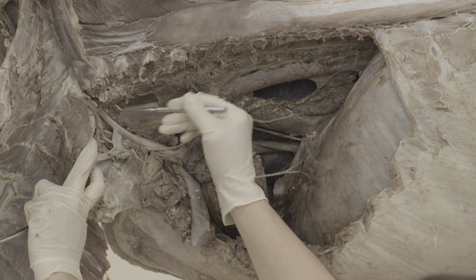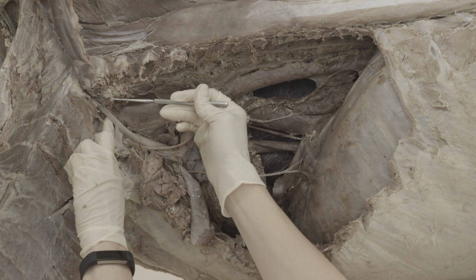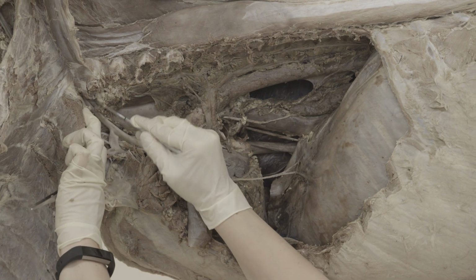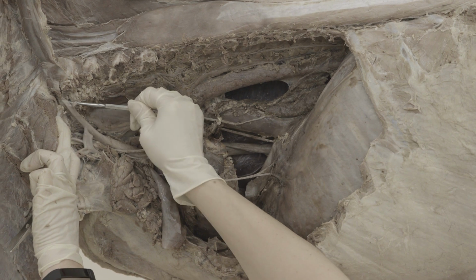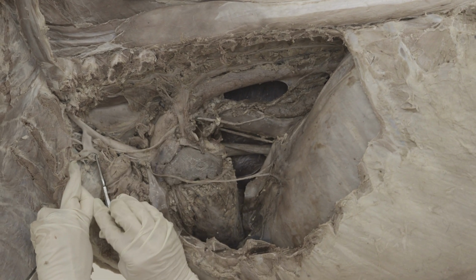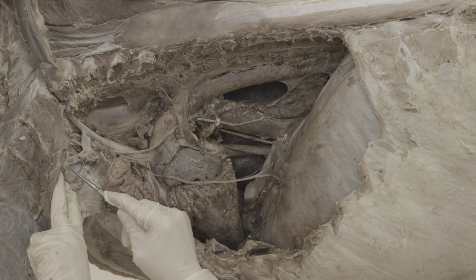And on your vertebral, it actually looks like we have our costocervical possibly coming off there rather than as a separate branch. So vertebral, but you have this common trunk. So common trunk, and then you have a costocervical artery that would go here and would have gone to the ribs. And then we have the vertebral, which I'll try and kind of pull out here. So vertebral is going deeper up towards the back there. So vertebral, costocervical, internal thoracic, the one going down inside the chest, and then the continuation here is axillary. So that's what's going out into the forelimb, axillary artery.